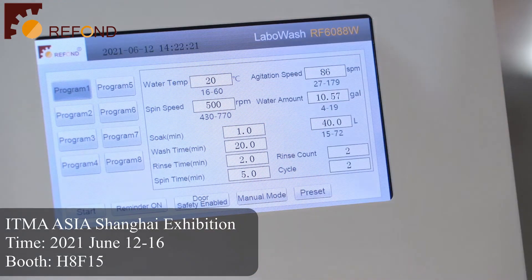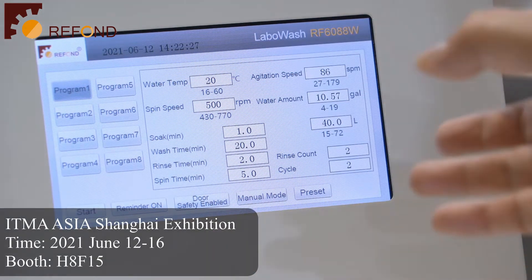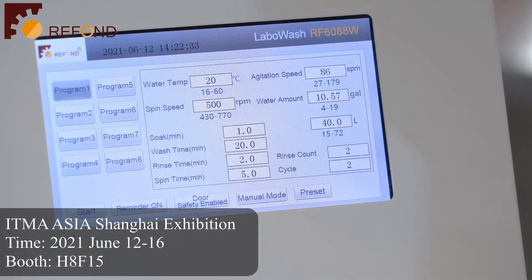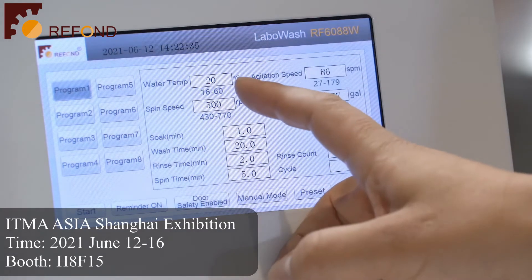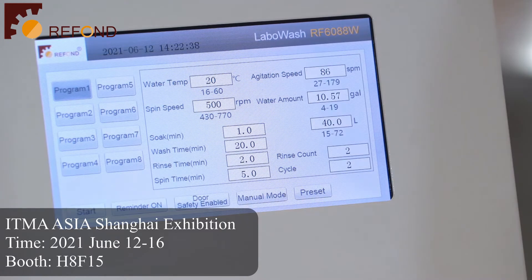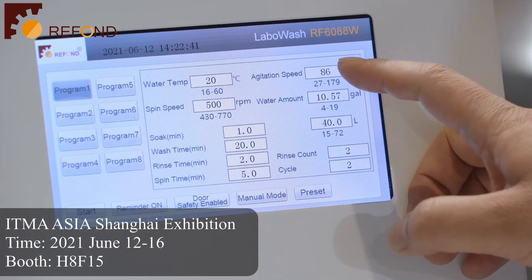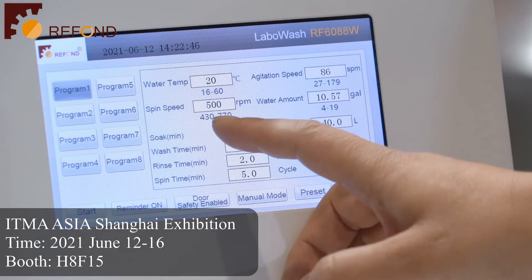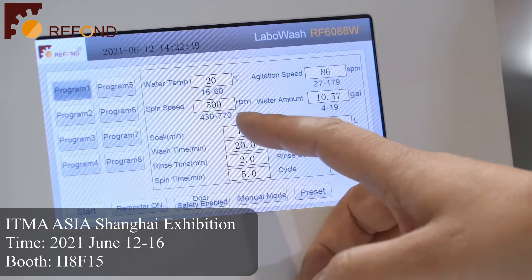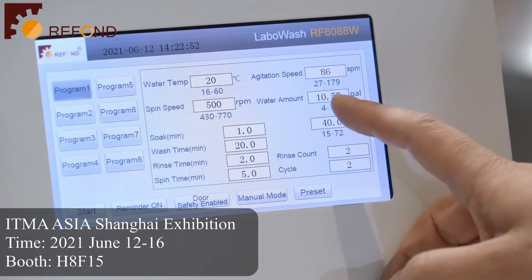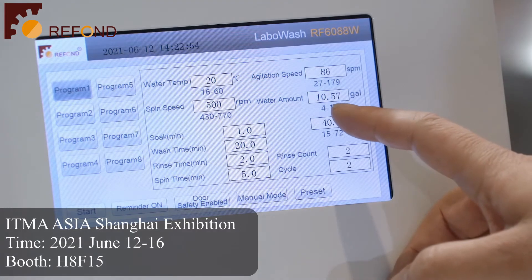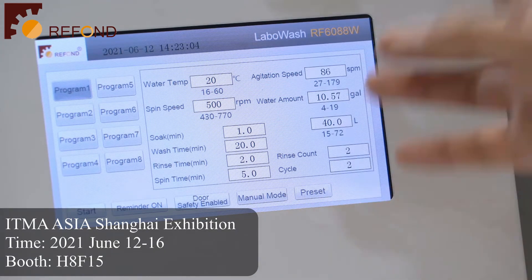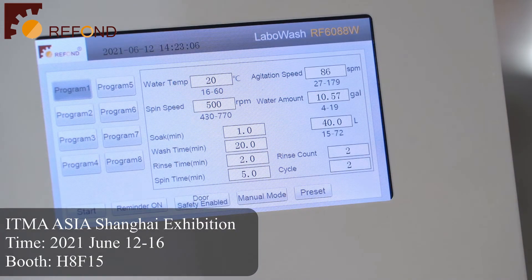Our LaboWash machine has a very wide range of testing for all parameters. For example, the water temperature can be set from 16 to 60 degrees Celsius. Agitation speed can be set by yourself, and the spin speed ranges from 430 to 770 RPM. Water amount ranges from 4 gallons to 19 gallons. All these parameters can be set, so the program is very flexible.